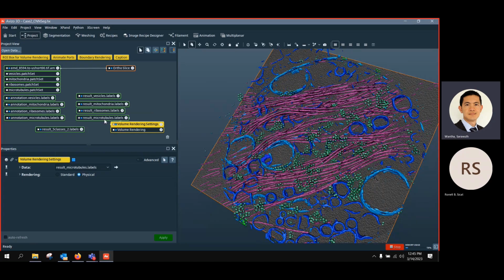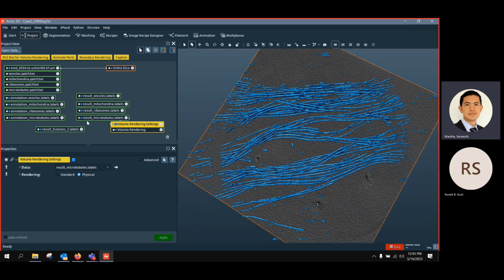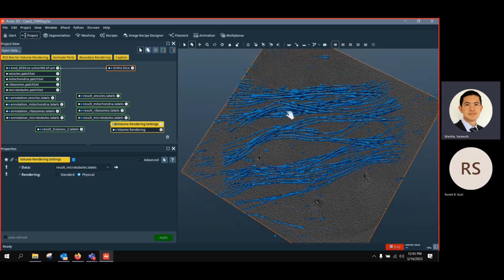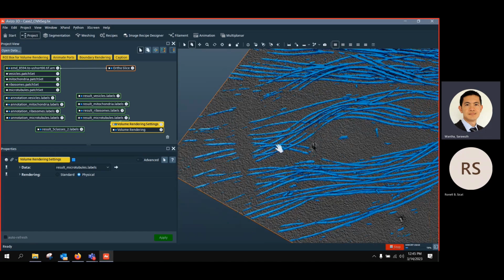If you use this AI-assisted tool to extract it, what you could do is clean up, for example, remove this small spot here, and later, wherever there is the missing wedge, you can maybe use manual tools to connect them to make it complete. This is how you finish up for the deep learning training.